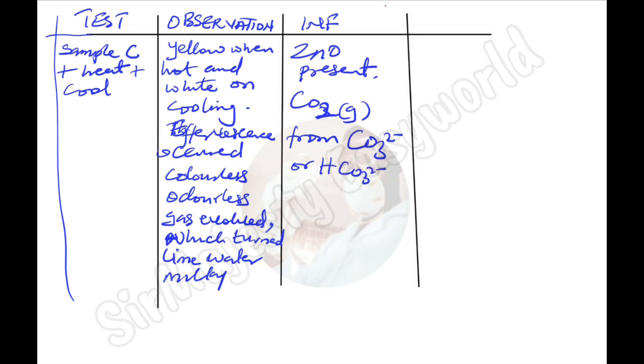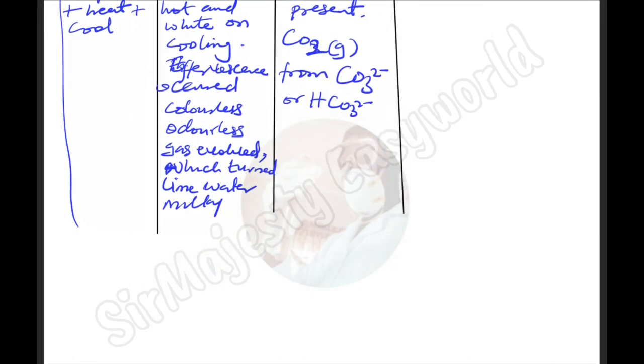Okay, then the next possible thing from my previous explanation is to dissolve some part of C in an acid. C plus dilute HCl. They can use H2SO4 or any other acid because the resulting zinc salt is soluble.